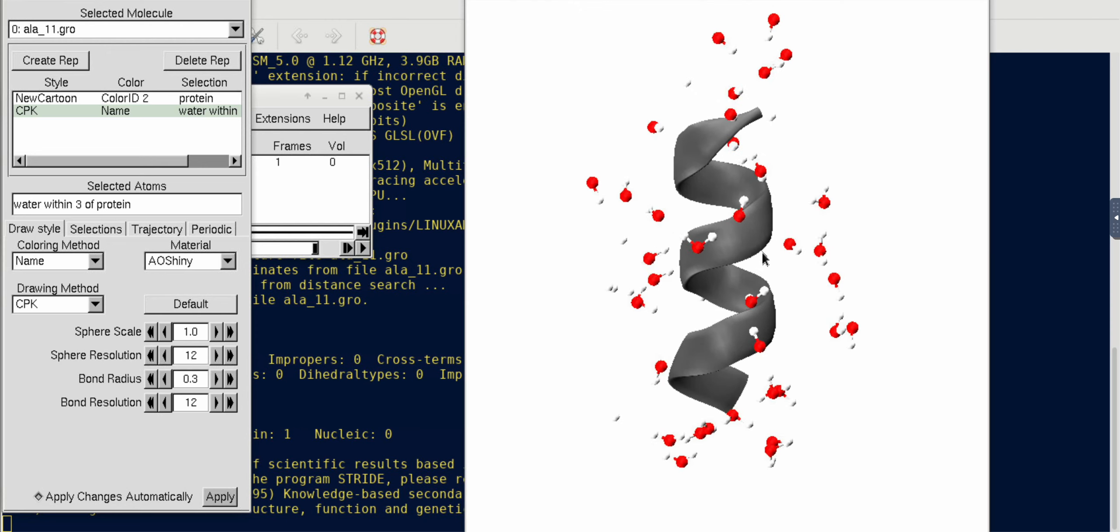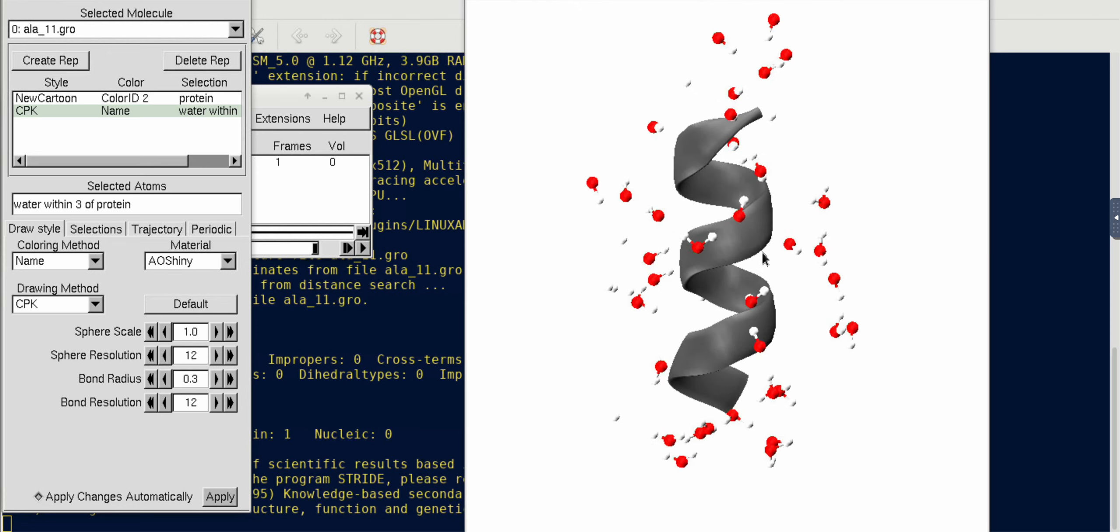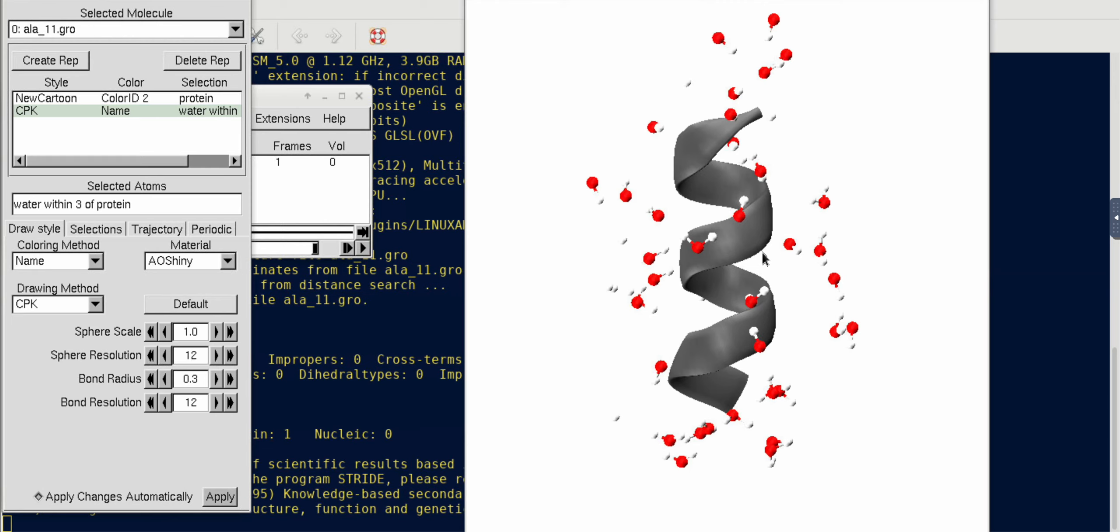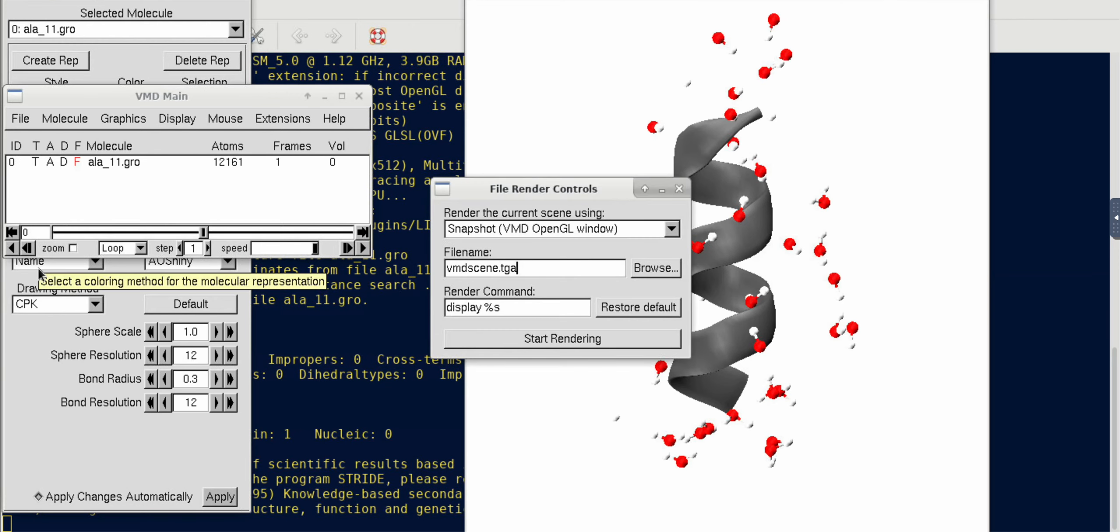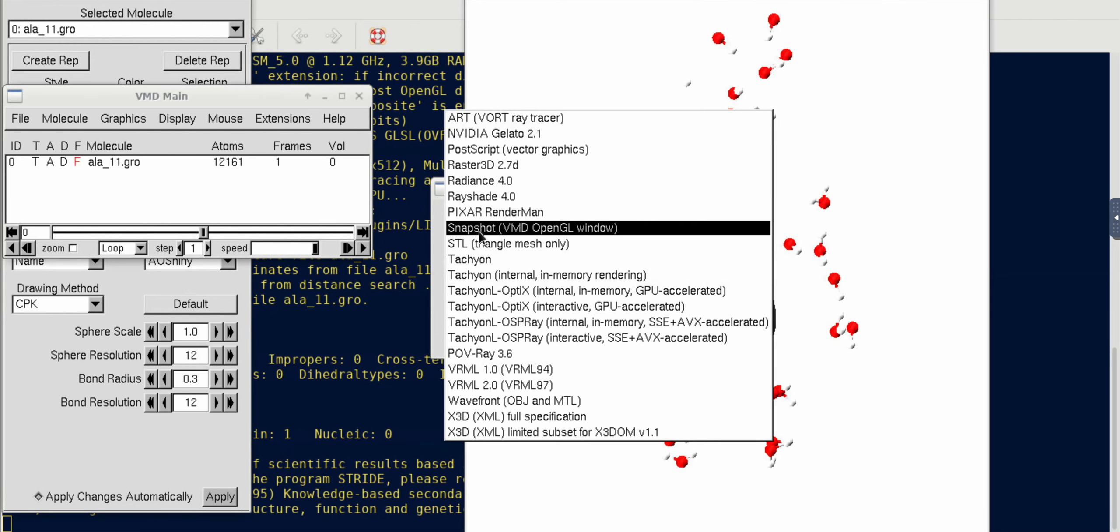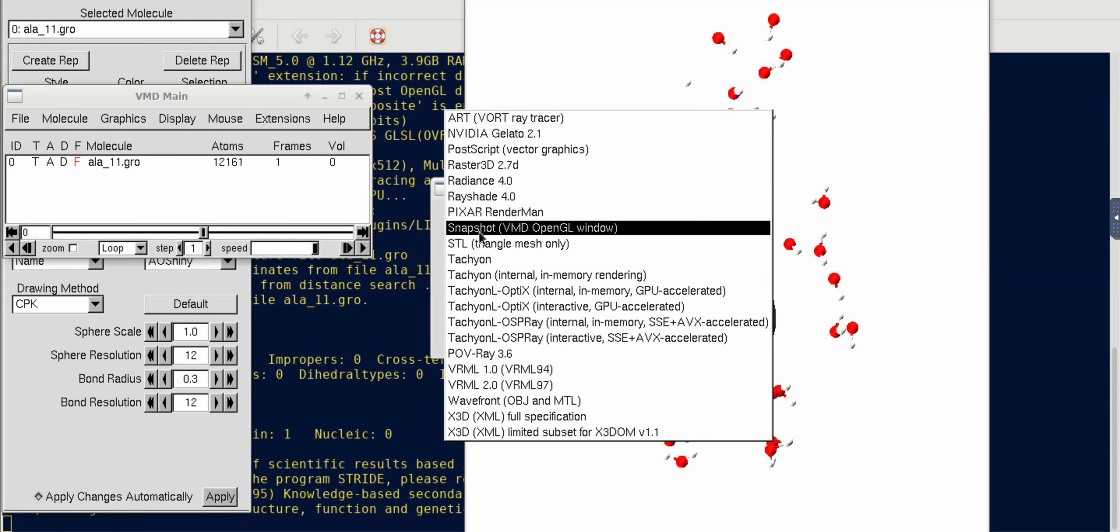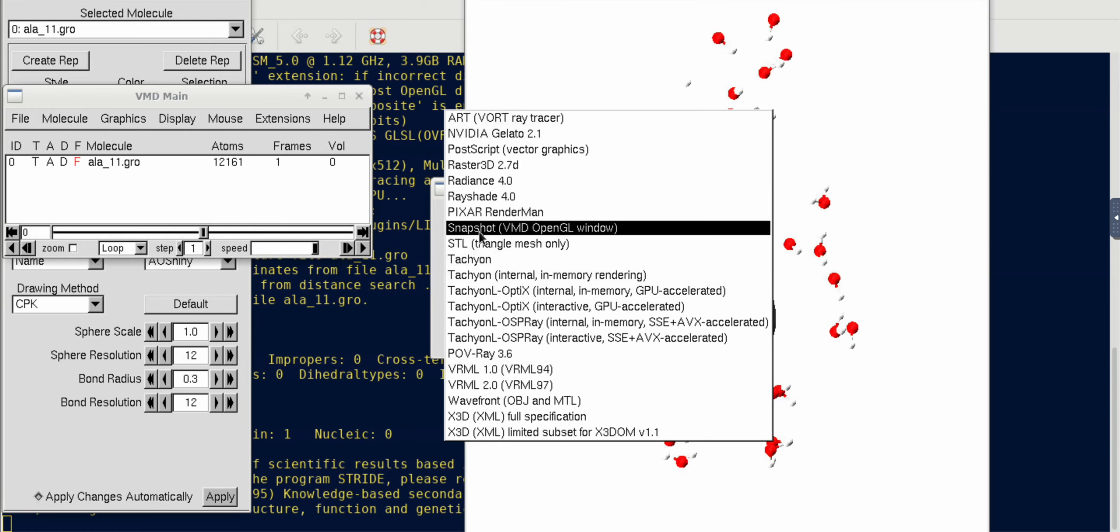We have to change the drawing method because with New Cartoon you cannot visualize water molecules, so you have to do CPK. You can see that there are several water molecules surrounding it.